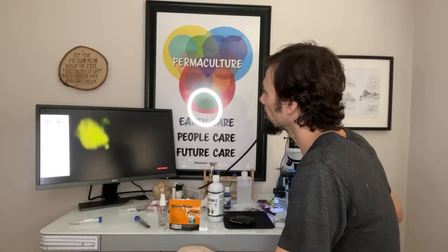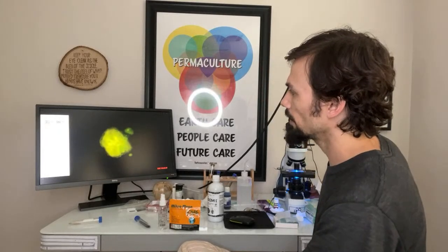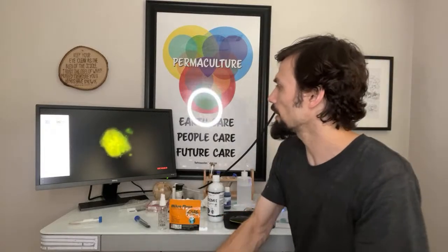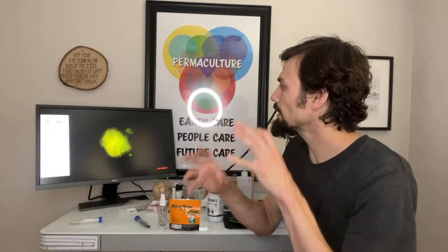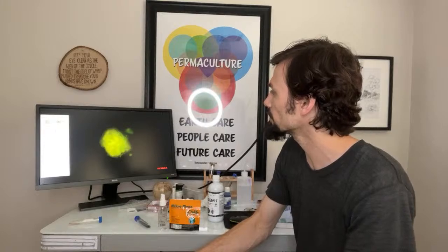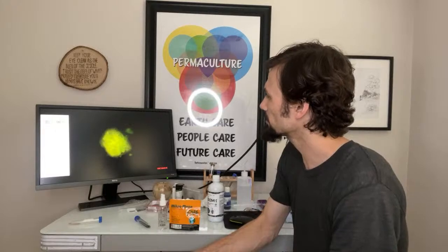So, this is an aggregate, not a root. And you can tell that because the specks of light are like little dots all over it. And so those could be spores, they could be crystals. I'd have to go a little bit closer. They're tiny though, kind of interesting.